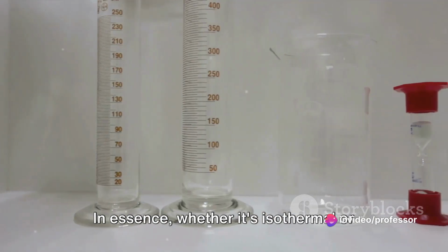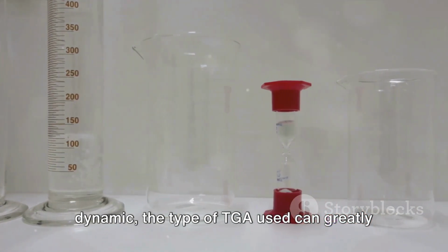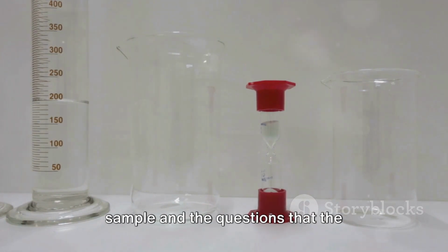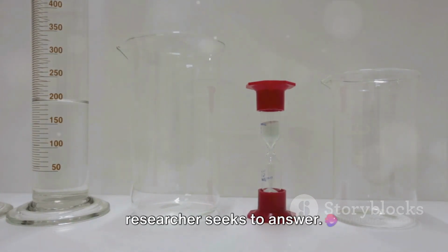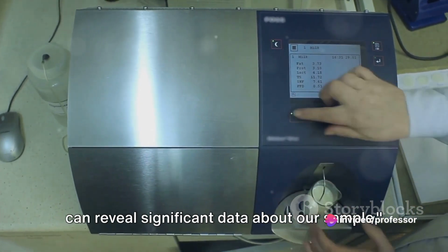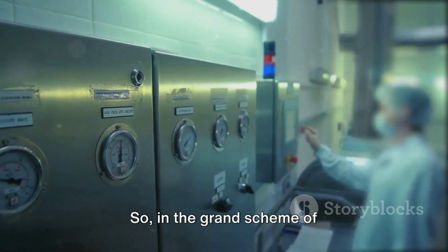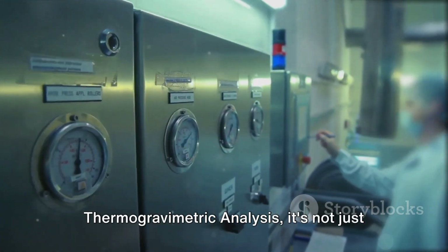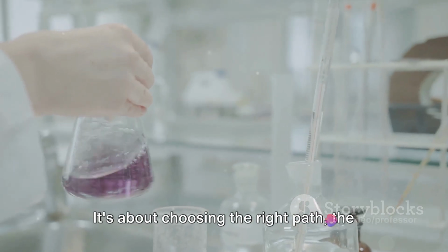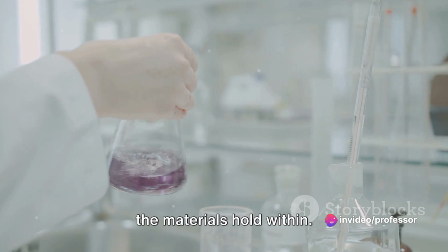In essence, whether it's isothermal or dynamic, the type of TGA used can greatly influence the data obtained. The choice depends on the nature of the sample and the questions that the researcher seeks to answer. And with the right tools, these types can reveal significant data about our sample. So, in the grand scheme of thermogravimetric analysis, it's not just about heating and weighing, it's about choosing the right path, the right type, to uncover the secrets that the materials hold within.